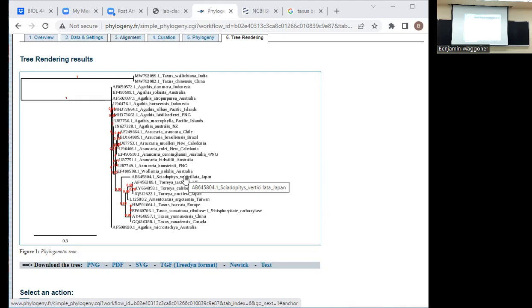By this evening, I'm going to have an upgraded version of this handout that's got somewhat more detailed instructions, and I want all of you to do this at home. You're all going to get slightly different results from what I got, and that's okay. But I want to see if you can find the same thing. All of the actual drawing of the trees is done by computer. You don't have to do that yourself.